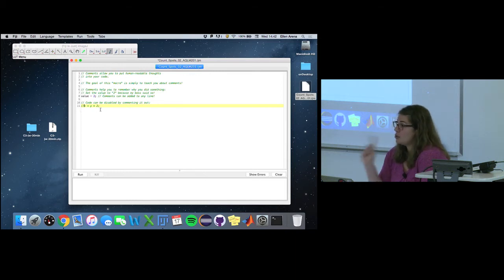But again, script parameters are a really weird exception. They can actually be read by the system, despite the fact that they're hidden in these comments. But we'll go over that in a minute.